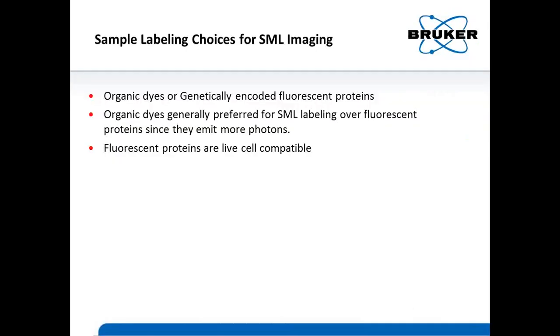Okay, so that was in summary the hardware and the software that you need in order to do live cell imaging. Now switching gears to what we can do at the sample. In terms of sample labeling choices for single molecule localization, you've got two options.